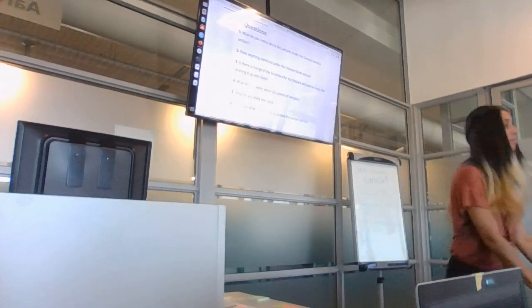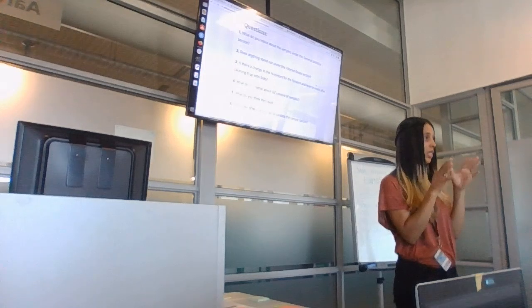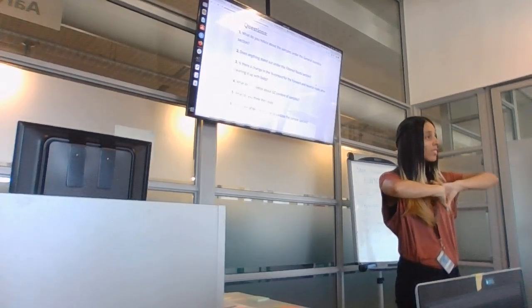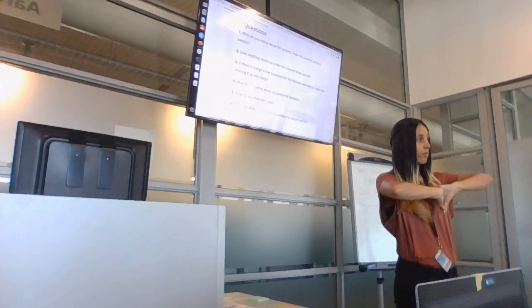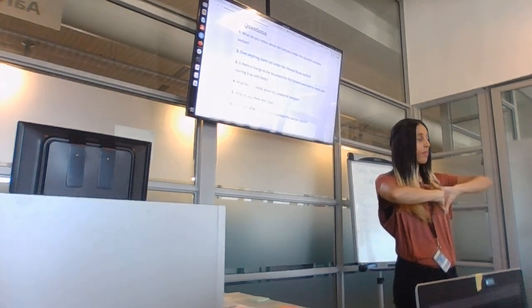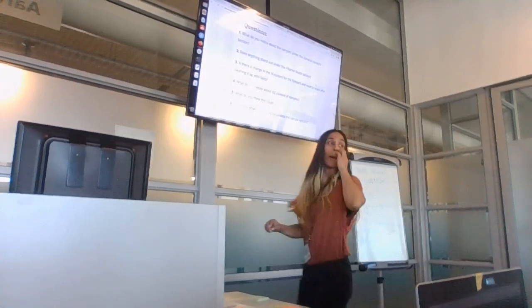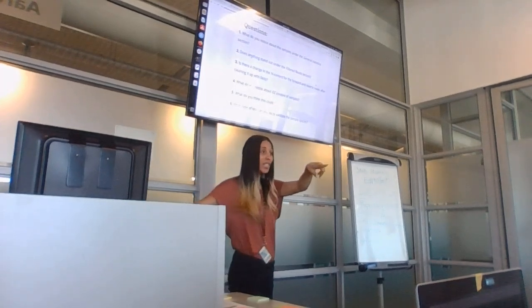You brought it in, your samples couldn't process, or something went wrong. What was the problem with your reads? I think we gave it a short time to run. Then the run was stopped before. But you had some reads, I remember. Yeah, we had, but then it was a mixture of. You had a mixture.